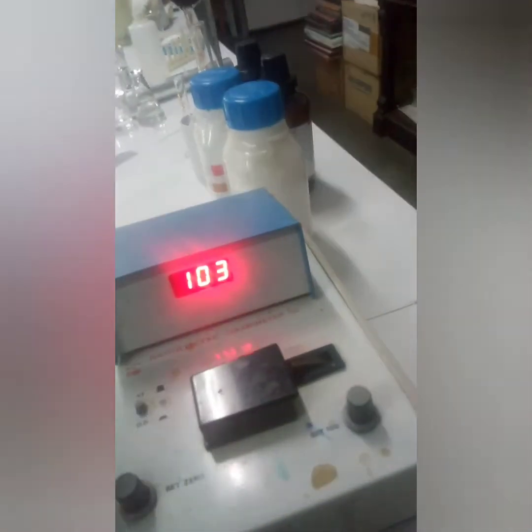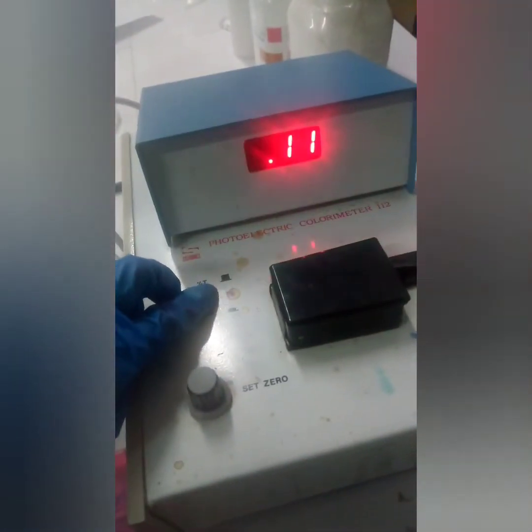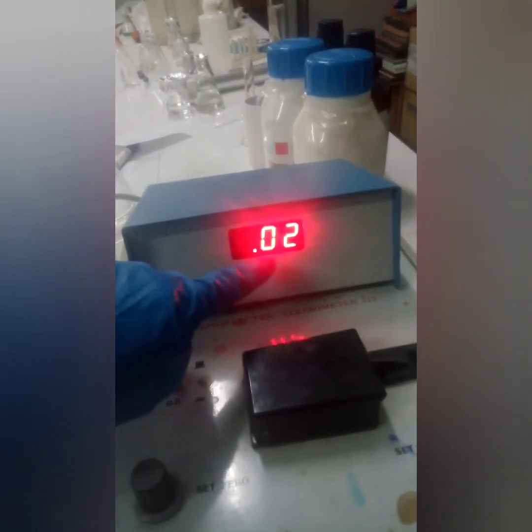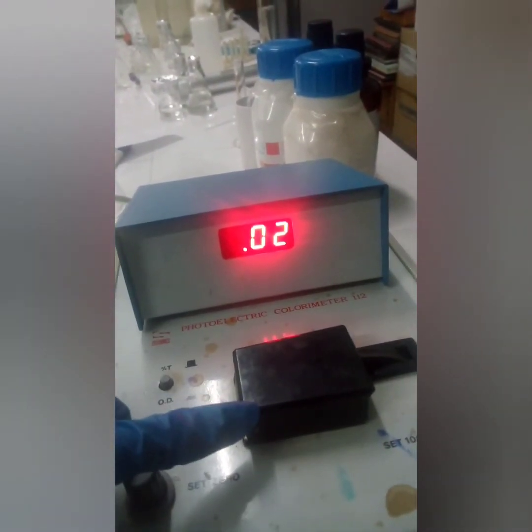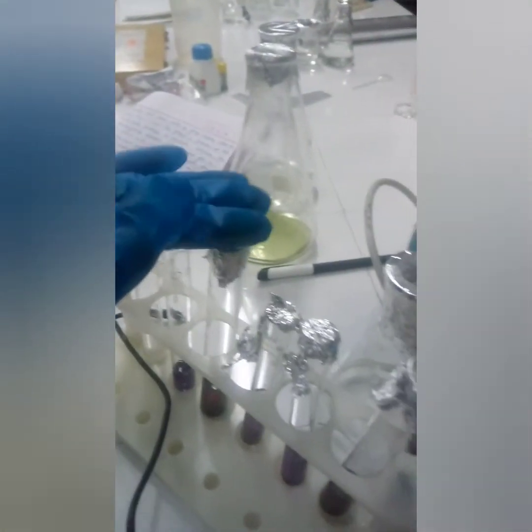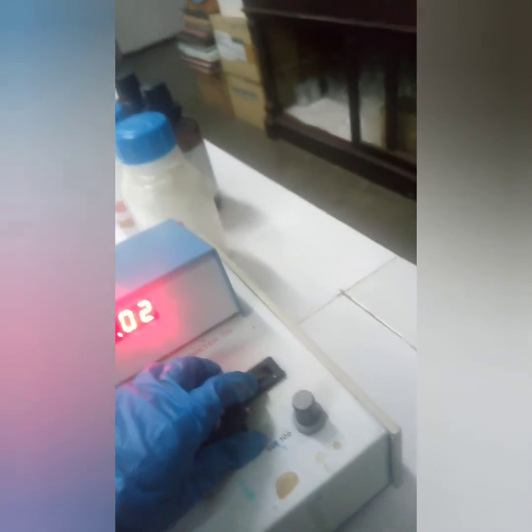Let us see. You can take the reading from here. In this way you will take the reading of all the samples, and then we will plot a graph for the standard curve.